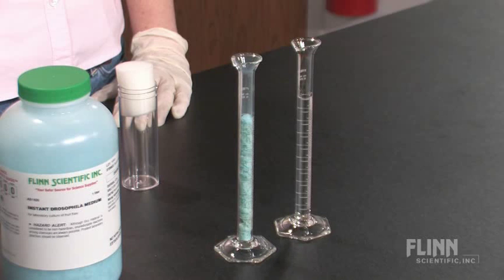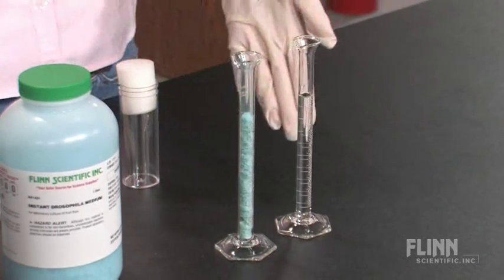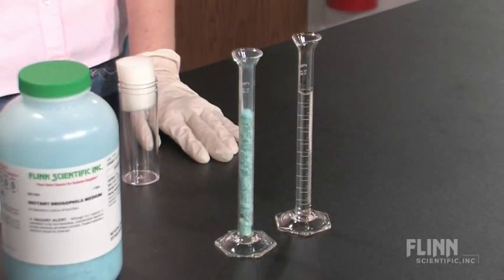First, measure 10 milliliters of the drosophila media in a graduated cylinder. Measure an equal amount of water in a separate graduated cylinder.